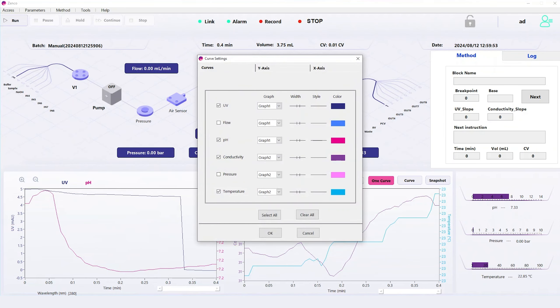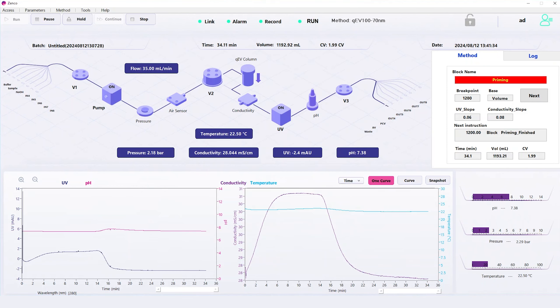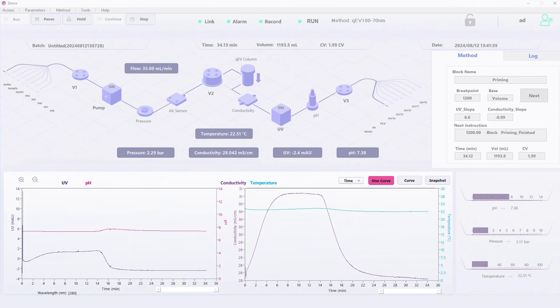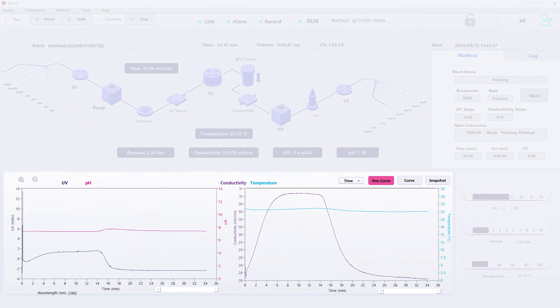Here, you can see the range of parameters that can be selected. In this case, we are choosing to display UV and pH over time, as well as conductivity and temperature.